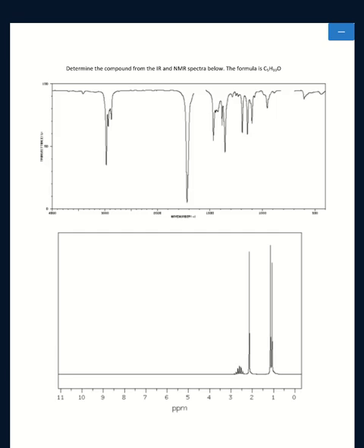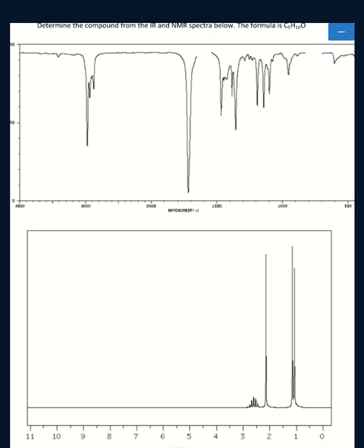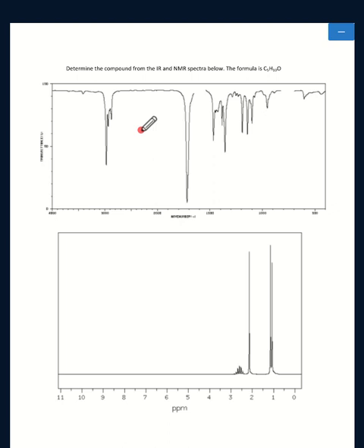And then page number 8, same exact thing. There's one molecule. The formula is C5H10O. Therefore, there is a single oxygen. And the IR will tell you if that is an alcohol, if that is a carbonyl, like for a ketone, or maybe an aldehyde, if you see that characteristic aldehyde hydrogen. And then the NMR will help you determine the different number of hydrogen environments, and then the N+1 rule.